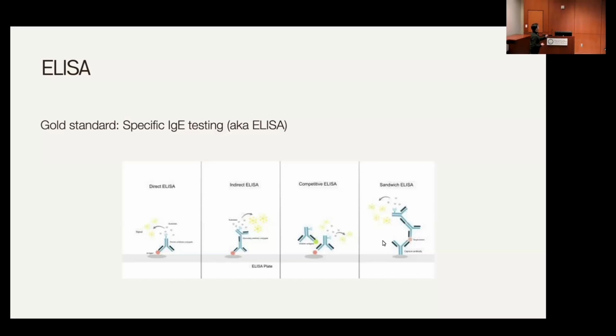One last mention before we get into the meat and potatoes of these subtypes of ELISA is the enzyme-linked antibody. The whole purpose of the enzyme-linked antibody is to be able to quantify how much analyte we have. Enzyme-linked antibodies are synthesized in the lab, so we know exactly what they're intended to bind to, but that's not what makes them special.